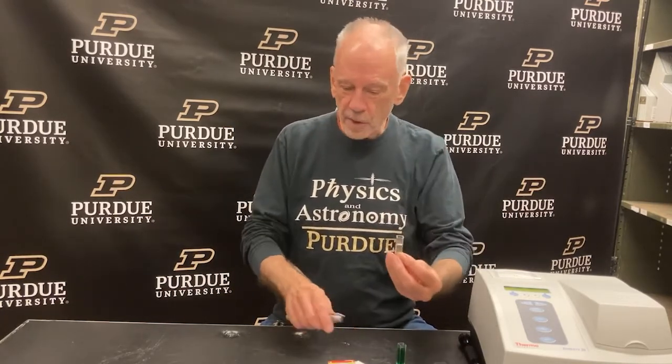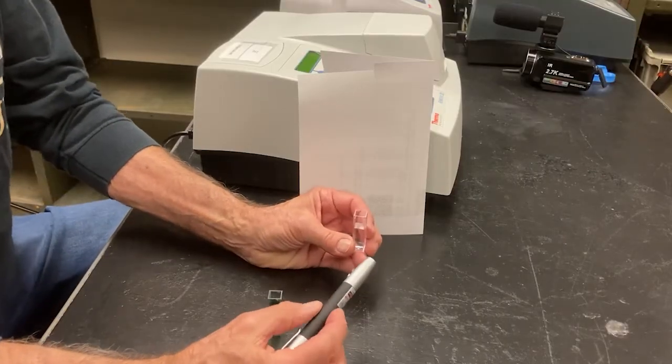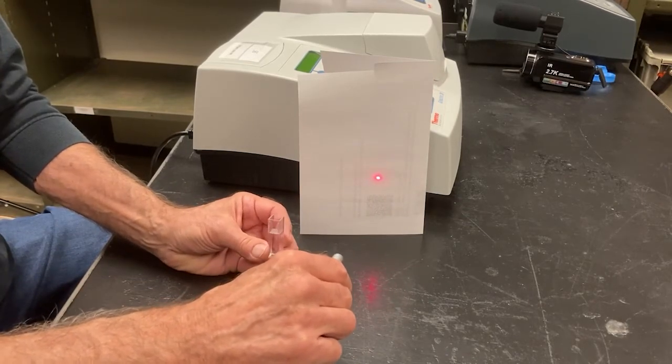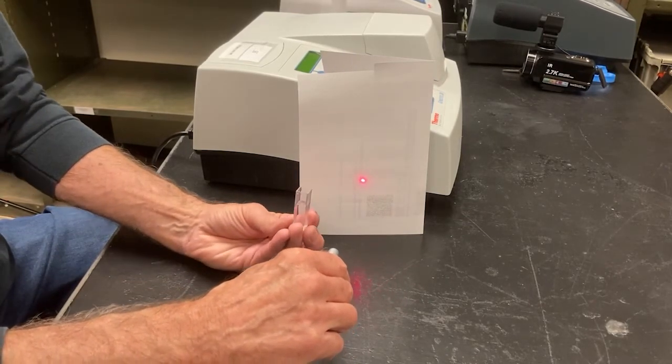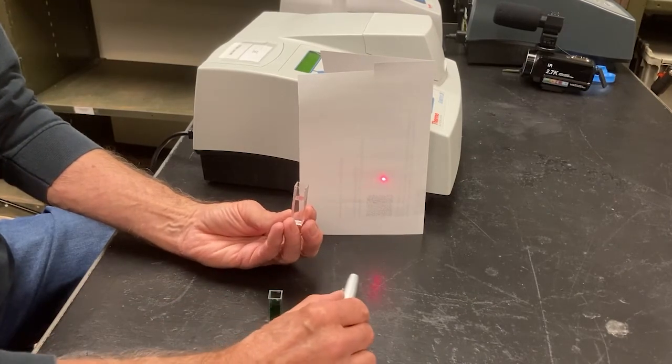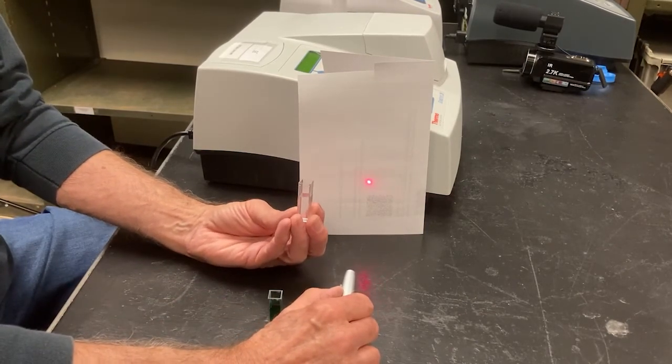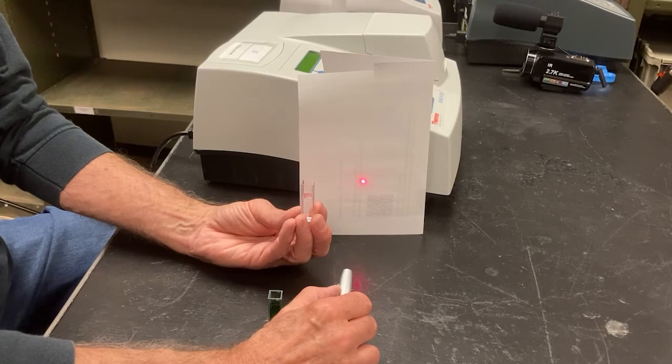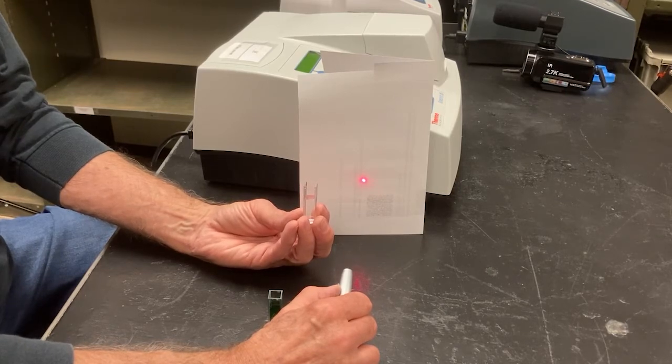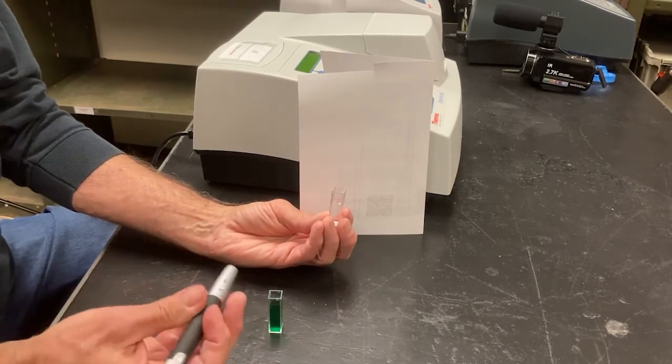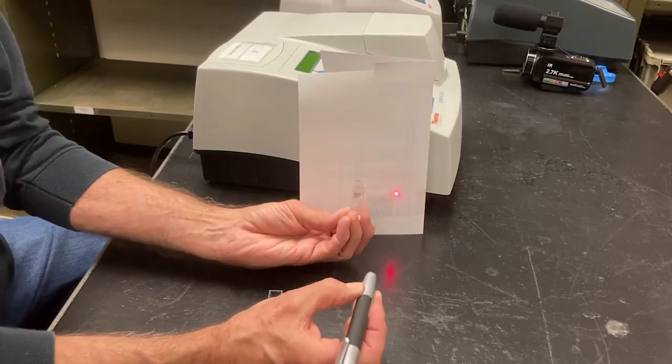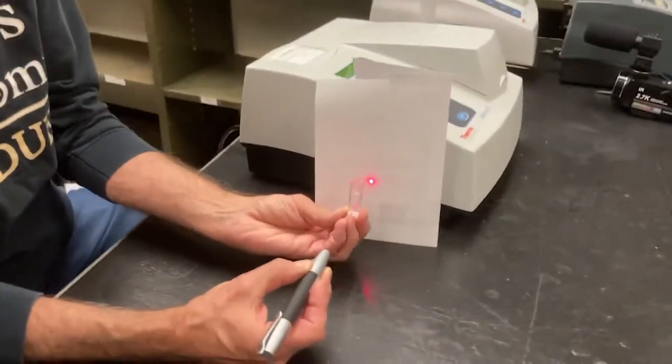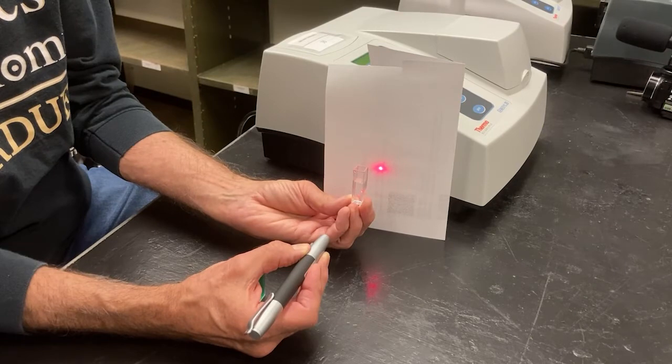Now, if we want to show you an example to demonstrate how this works, I just have a laser pointer, okay? And I'm going to pass the laser pointer through a cuvette that has just water in it, okay? And what would you expect to see when the red beam goes through the water? I think you're going to get it shooting all over the place. Okay. Well, let's see. So, we have a narrow beam of red light. We shoot it through the cuvette and can you see that, Bill? Yep. It just went right through.